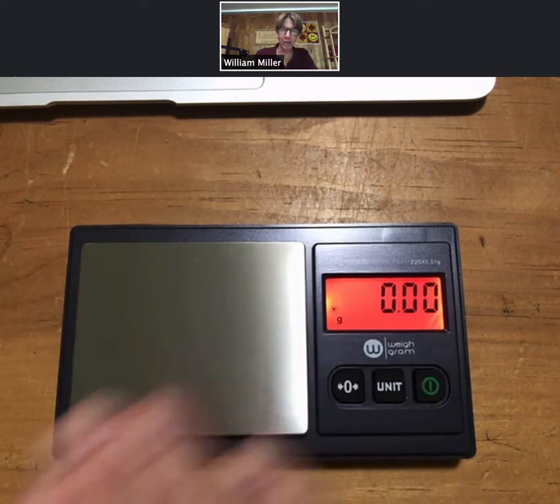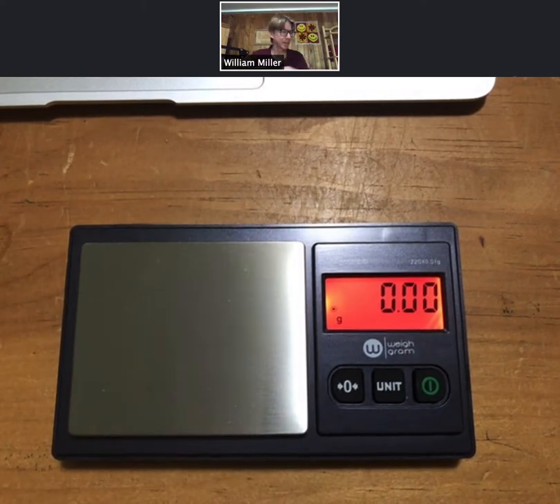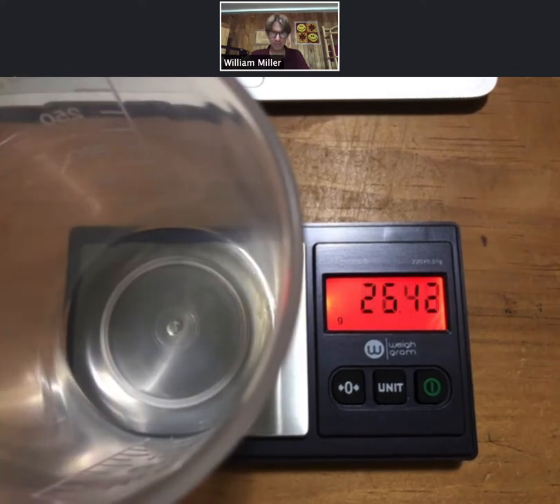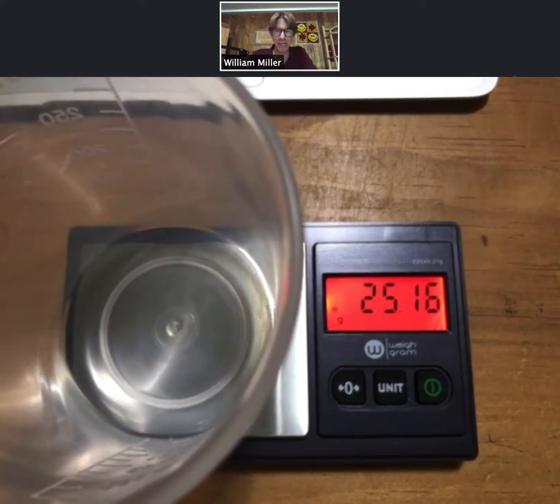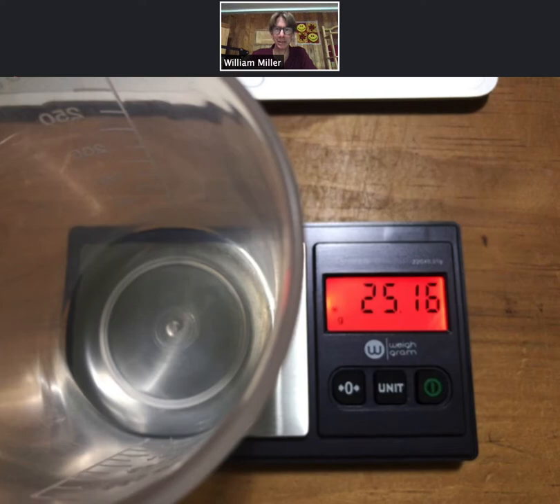I will always reference nothing on the scale as 0.00. Now I'm gonna put my beaker on. See the little dot disappear? Then when the dot comes back, that means you can write it down, and we would write down 25.16 grams.